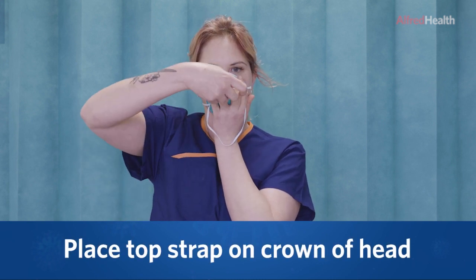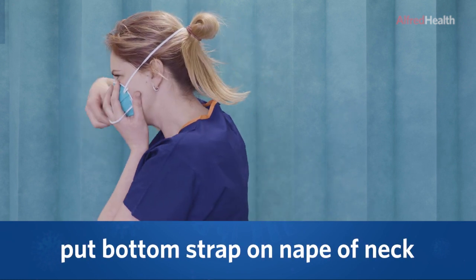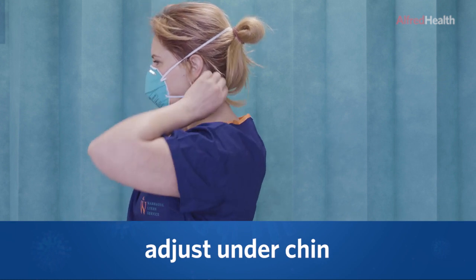Put the top strap on the crown of the head. Put the bottom strap on the nape of the neck. Adjust under the chin as required.